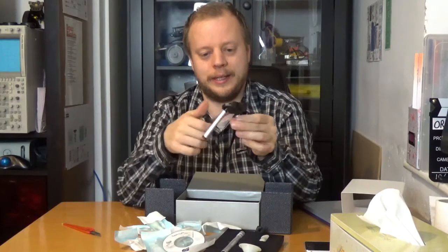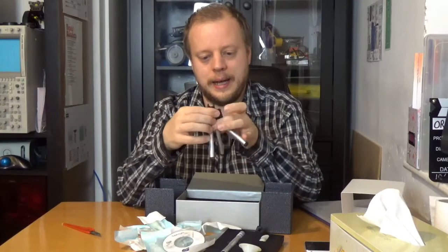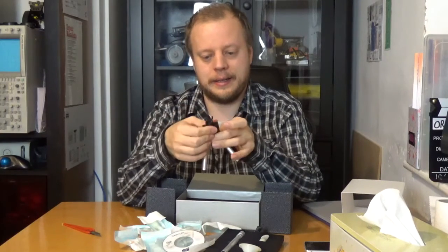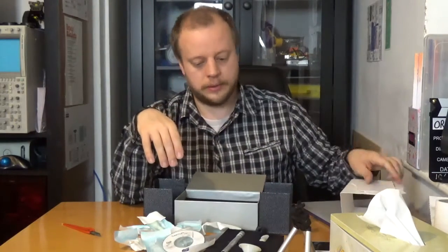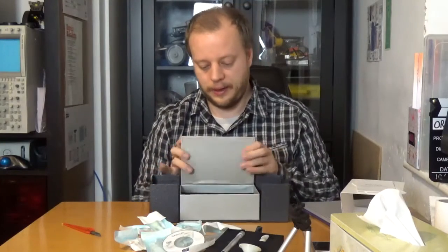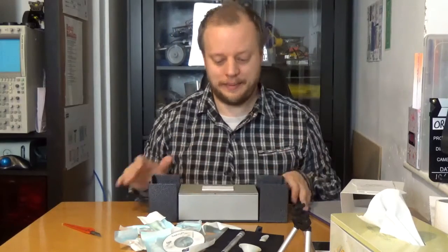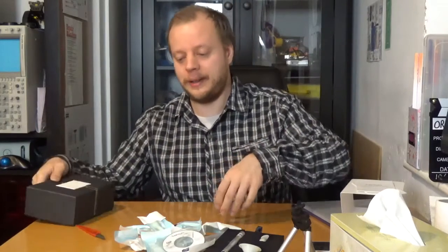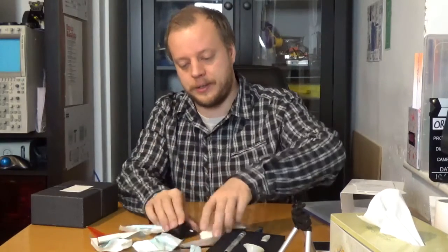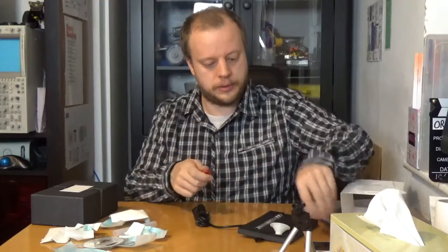I see - this one's fixed, these ones move out. That releases this, okay, and that turns that - so you can set that up to look at something. And of course there's some manual and documentation in there. I do like this box - it's very plush, makes it look like some iPad packaging. I've never seen packaging like that for something like this.